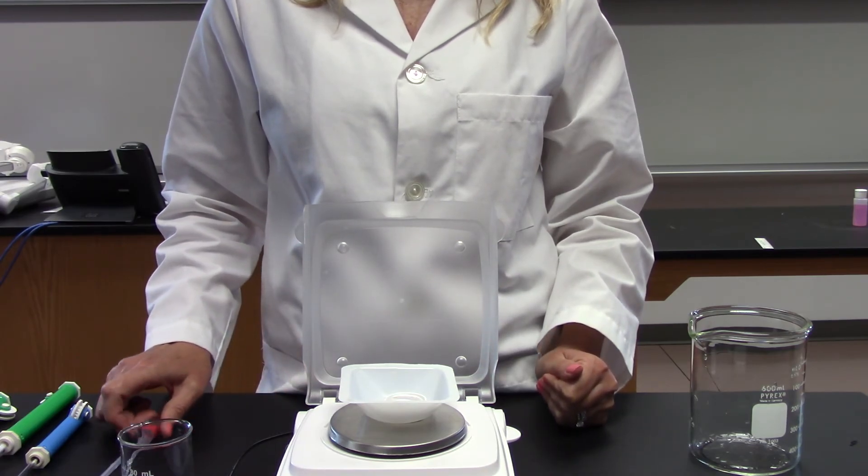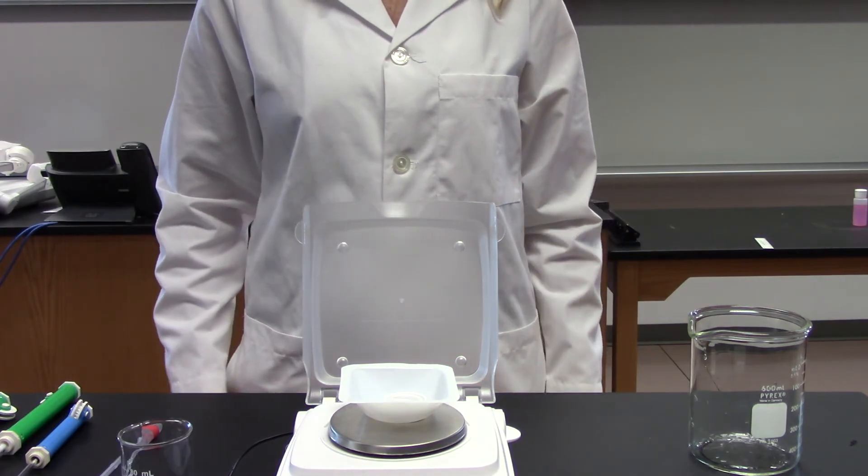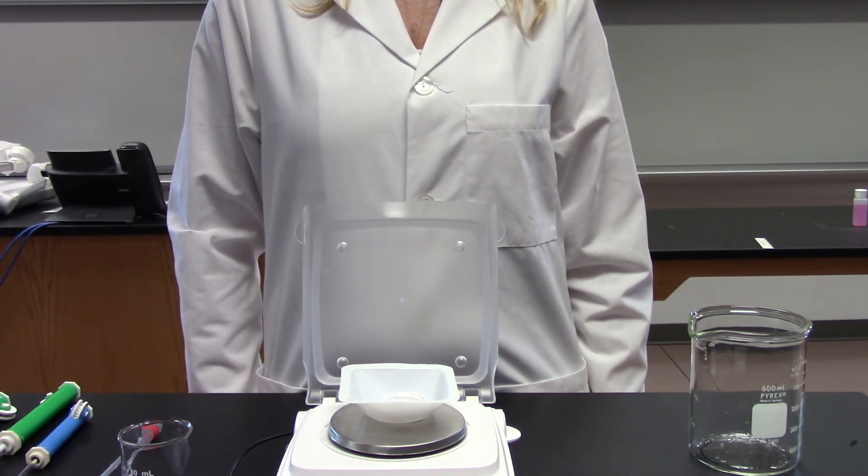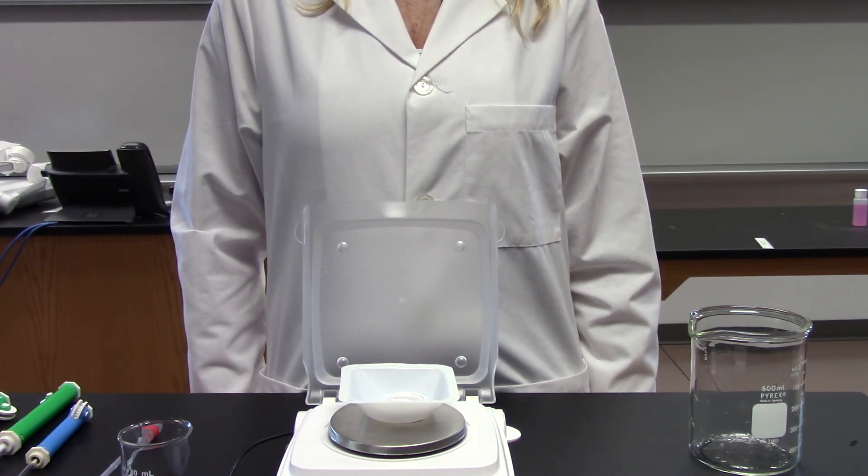Thermometer in this class - sometimes you'll be measuring in Fahrenheit and converting to Celsius, and sometimes you'll be directly measuring in Celsius. It just depends on what thermometer is put out that day. So sometimes you will have to do a temperature conversion. It's important to know how to use those equations.